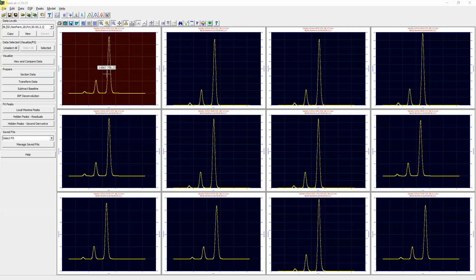The IRF deconvolution option is used to remove a known IRF for instrument response from data prior to fitting or other analysis. The removal of the instrumental distortions in a pre-processing step allows for fitting very fast closed-form peak models to the data. This procedure is most useful for chromatography data where all of the best IRF-bearing peak models are convolution integrals that don't have closed-form solutions.